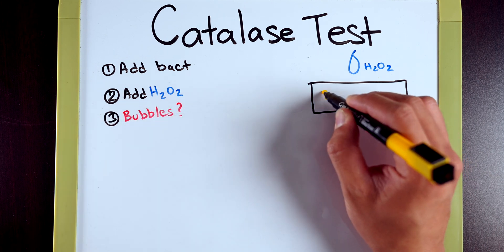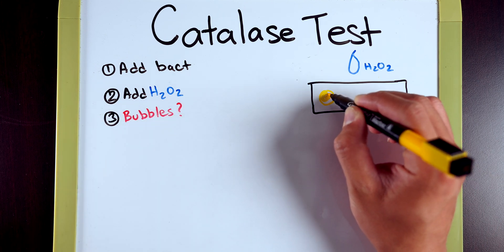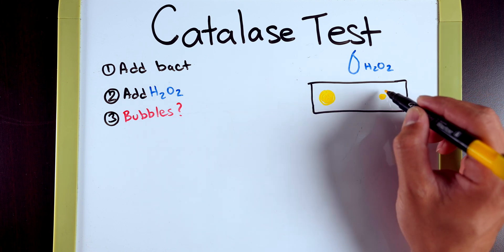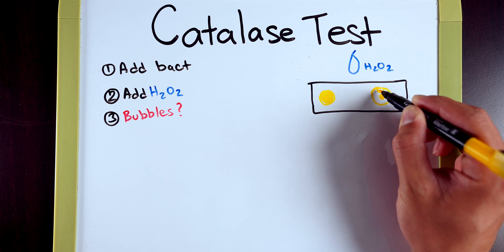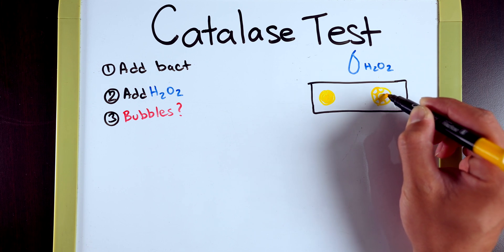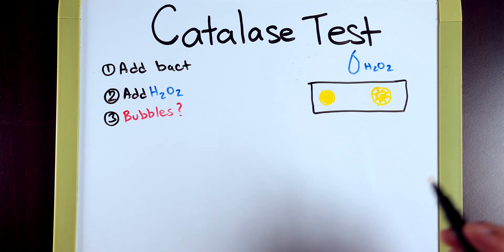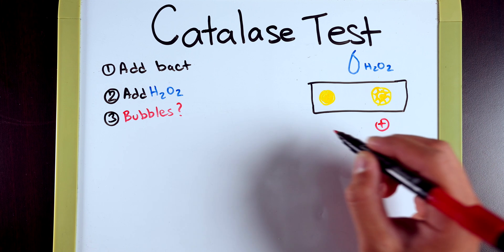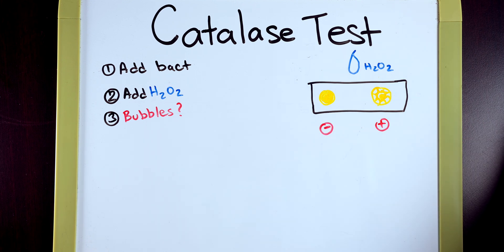So one of these bacteria when you add the hydrogen peroxide will just be pretty much inert and nothing will happen. But the other one, when you do add the hydrogen peroxide, you'll notice the formation of bubbles and it's going to be pretty rapid as well. So this indicates to us that we have a positive result and this means that we have a negative result.